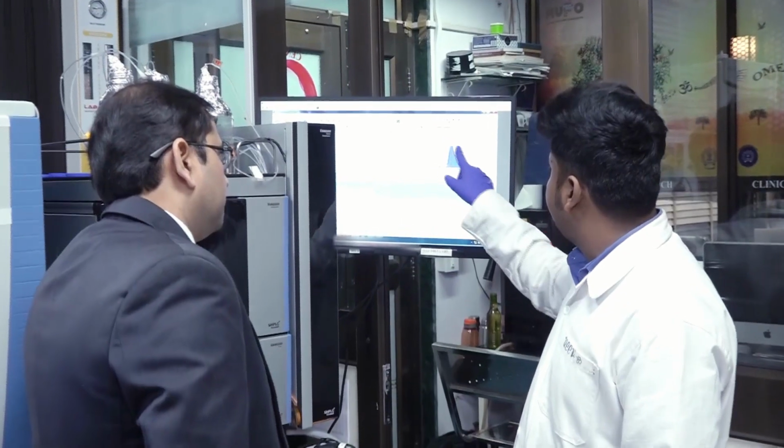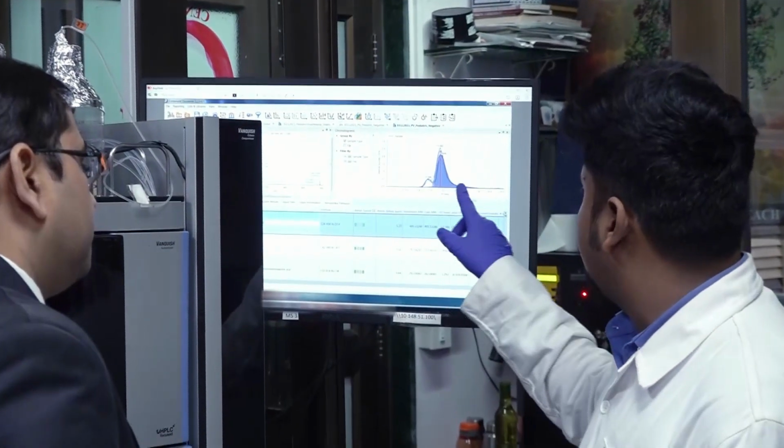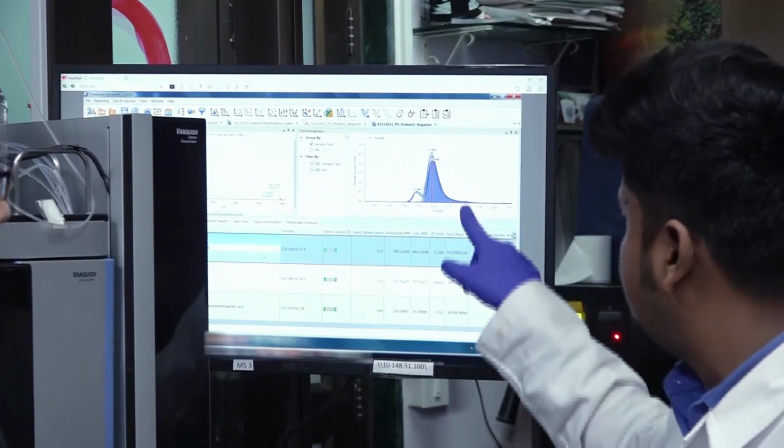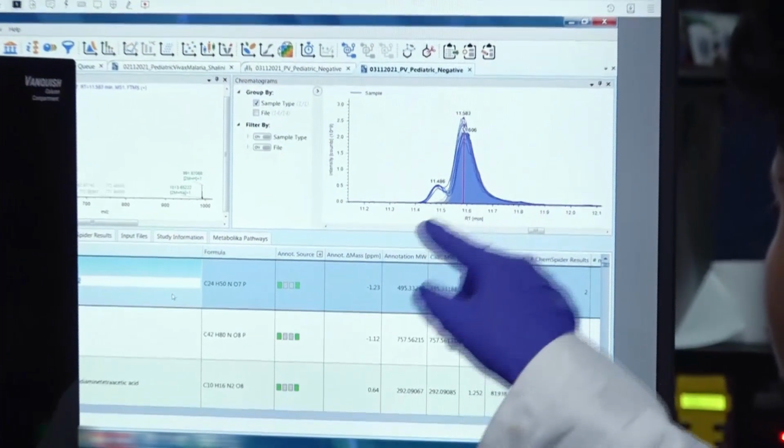The aim is to look at the entire complex proteome or metabolome and identify some of the biomarkers of interest using high-resolution mass spectrometry based omics analysis. First of all, we want to investigate the proteome from the tissue sample or body fluids like plasma, saliva, urine and various biological samples. The first aim is to investigate which are all the proteins present in these biological samples.